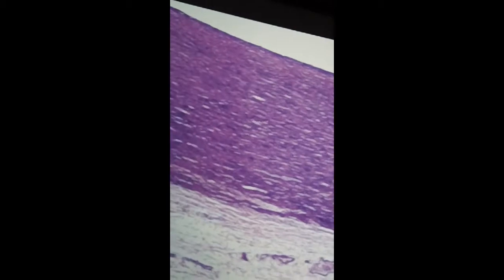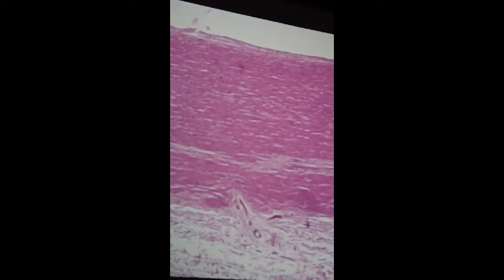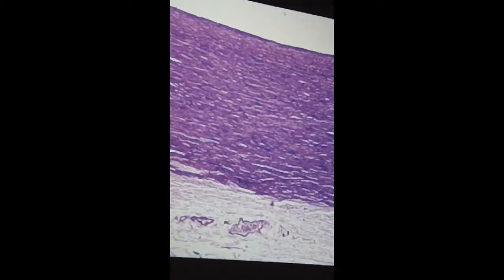Here are elastic lamellae. Same song, second verse, they just show up better. If you looked at this and shut your aperture diaphragm down, you'd be able to see those elastic lamellae. Okay? Here we see them, or get a sense of them, with an elastic stain.